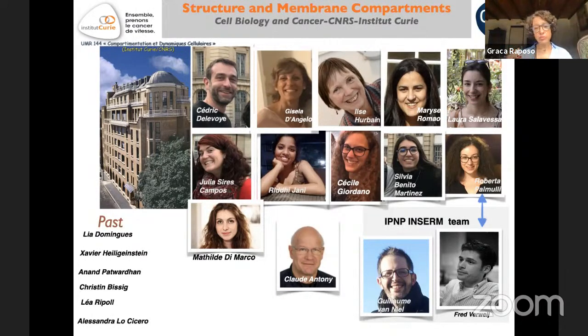You fix your samples with paraformaldehyde and with a mixture of paraformaldehyde and glutaraldehyde, and then you try both in parallel, just with a single label and increasing dilutions. Normally, if the antibodies have already been used for immunofluorescence, generally we increase the concentration by 10. If you dilute an antibody 1 in 2,000 for immunofluorescence, I will try dilutions at 1 in 200.